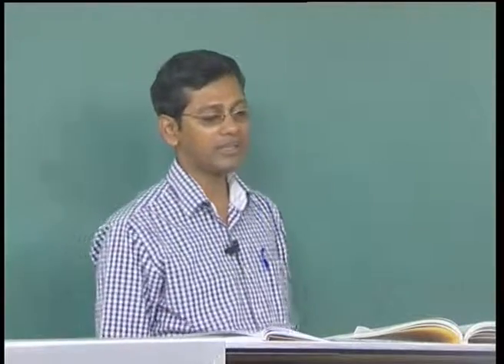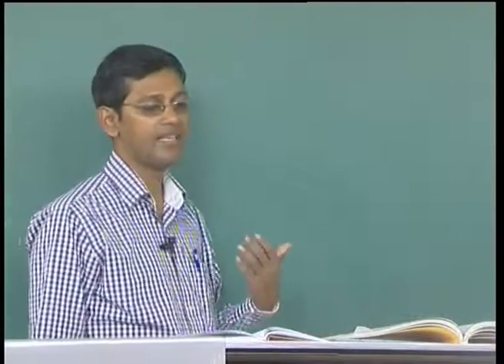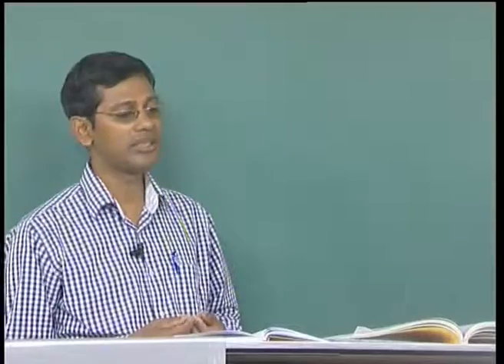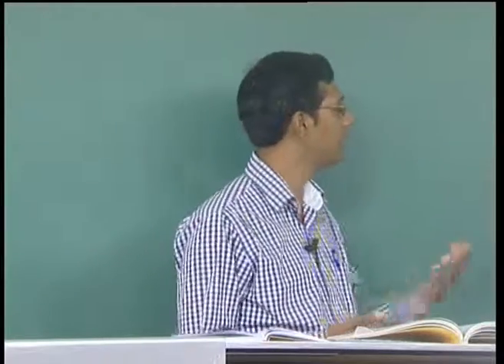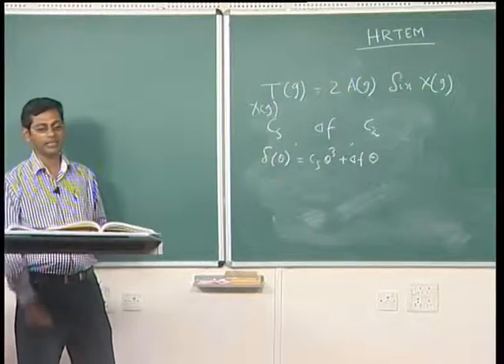Basically, the rays passing through the objective lens at an angle theta are not focused to the same point, because of the spherical aberration and the finite value of delta f. But we need to consider not only one value of theta but all the values of theta.